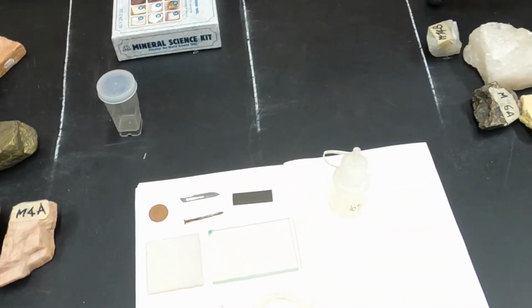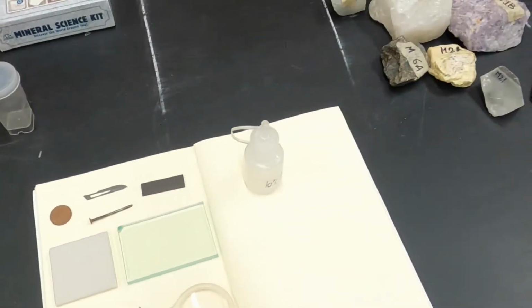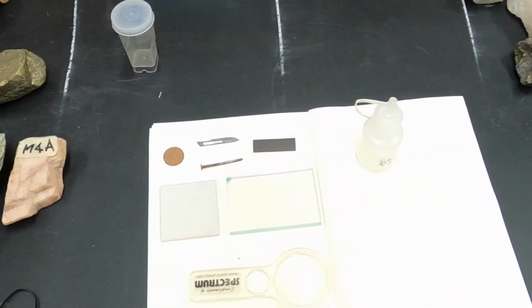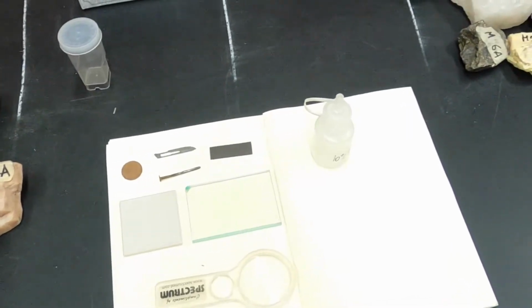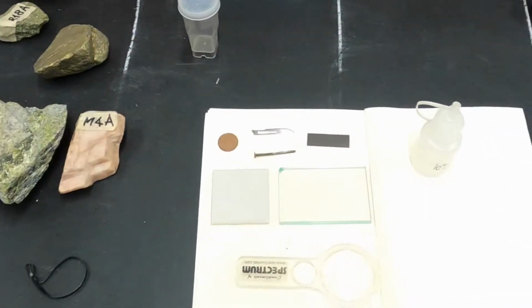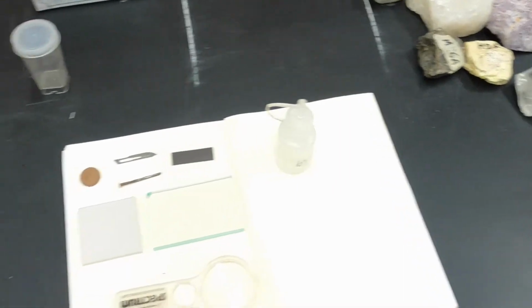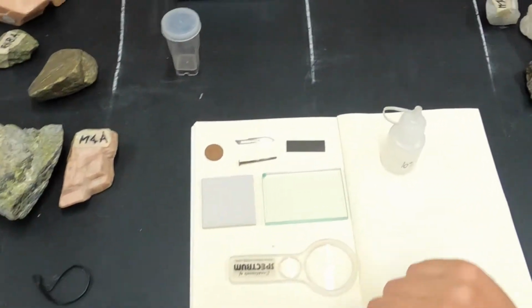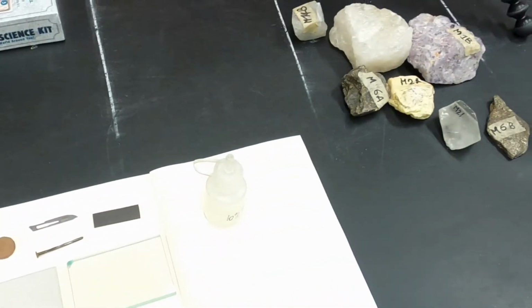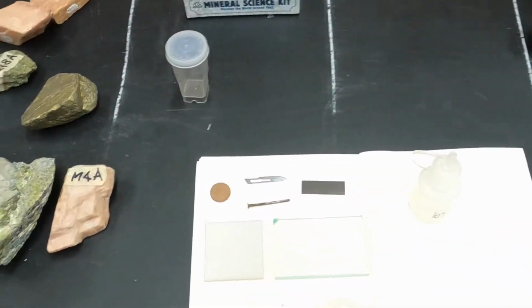Okay, in this video we are going to have a look at the tools that are commonly applied to the identification of minerals. The tools are used to identify the properties of minerals, and most of the tools are used for hardness. We have already discussed and introduced the tools, but here it's worth having a recap and looking at them.